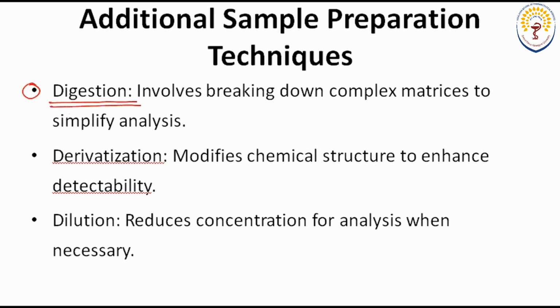Digestion actually happens during a kind of analysis known as gravimetric analysis. While you are performing gravimetric analysis, you do this kind of sample preparation. In gravimetric analysis, we form a precipitate in the sample.